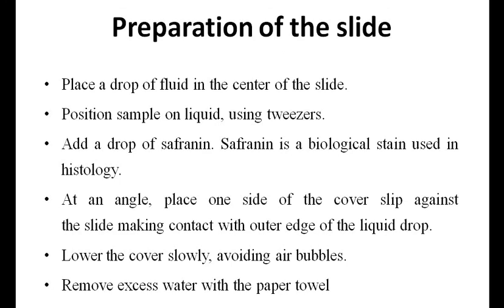At an angle, place one side of the cover slip against the slide, making contact with the outer edge of the liquid drop. Lower the cover slip slowly, avoiding air bubbles. Remove excess water with a paper towel.